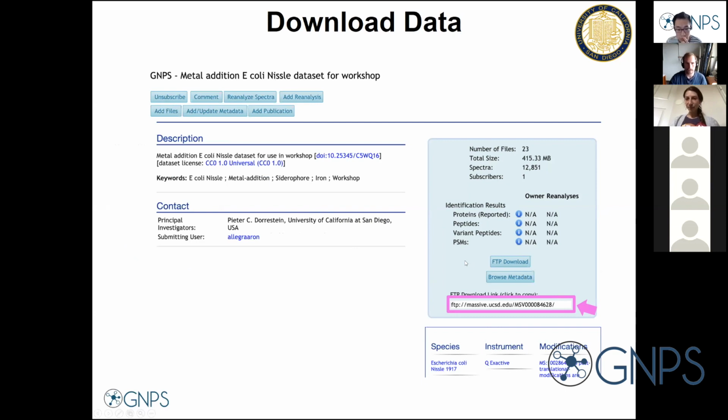So, okay, at this point, we should see this page pop up, and then we can click on this FTP download here. Okay, and then next slide.